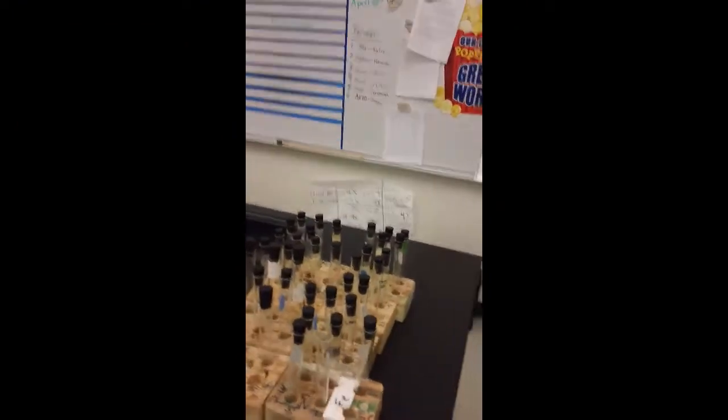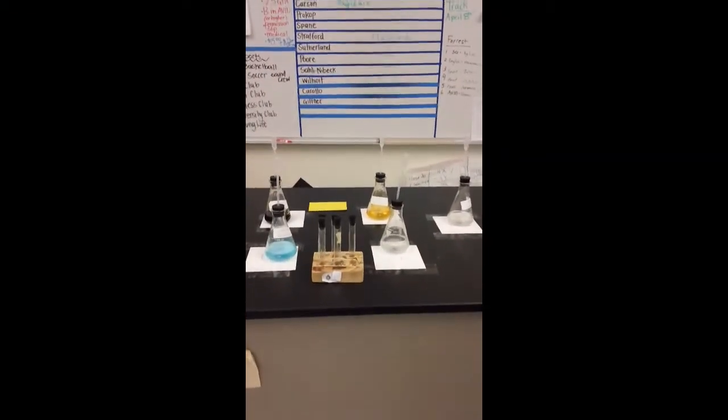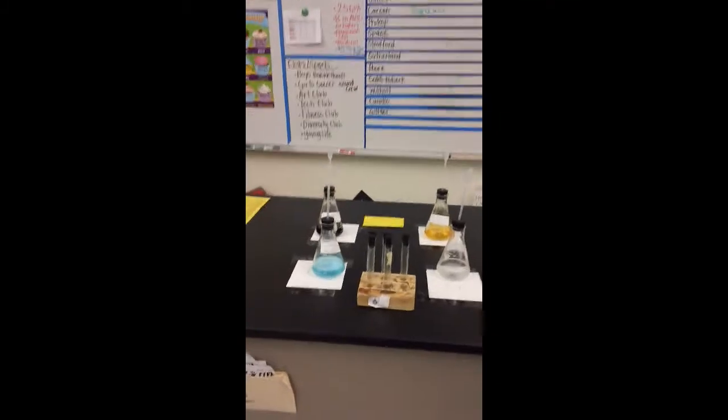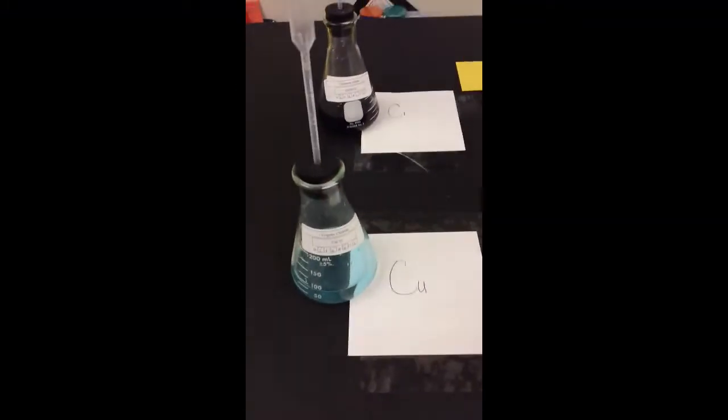Students came here, they got one wooden block full of 5 test tubes. Notice how they all have stoppers. And then what we did is we came over here and we had 5 different known solutions. So for example, we know that this one over here is Cr, which is chromium, and it's a chromium nitrate. Then we have Cu, and this is our copper chloride.